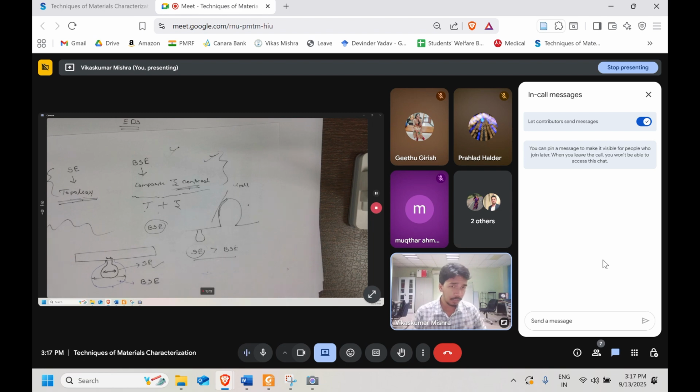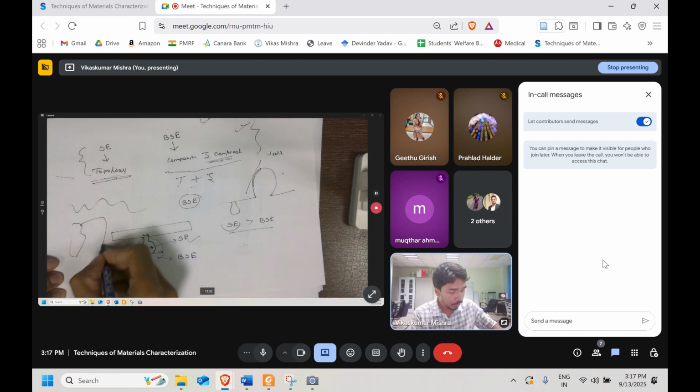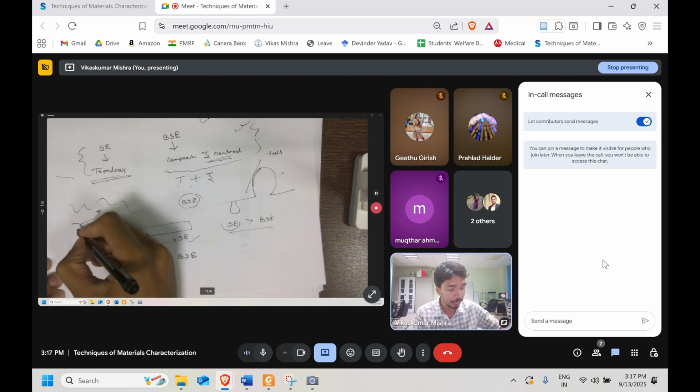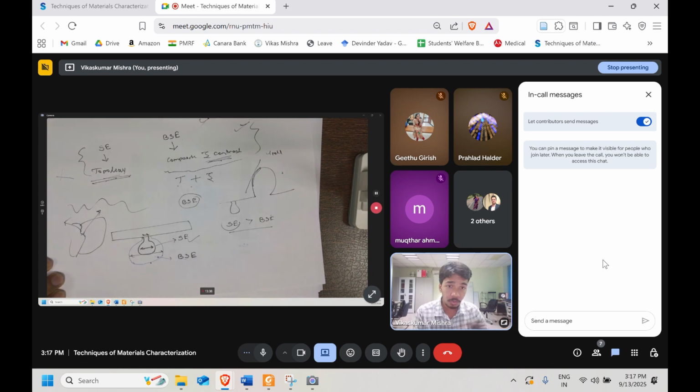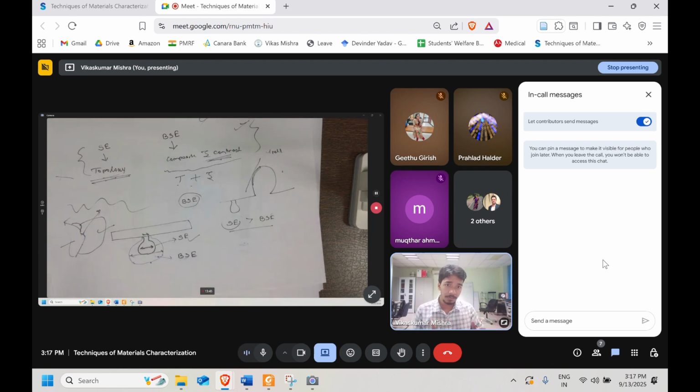What we can say is that on a larger scale, in the SEM, whenever I did it till now, I don't tilt the specimens. Let's say these are two grains, and this is the grain boundary. This grain boundary itself will scatter the electrons in other directions, so I won't be able to see them. The darkness will be here, and this will be the brighter one. So your specimen itself has a variety of surface roughness, a variety of tilt corresponding to them.